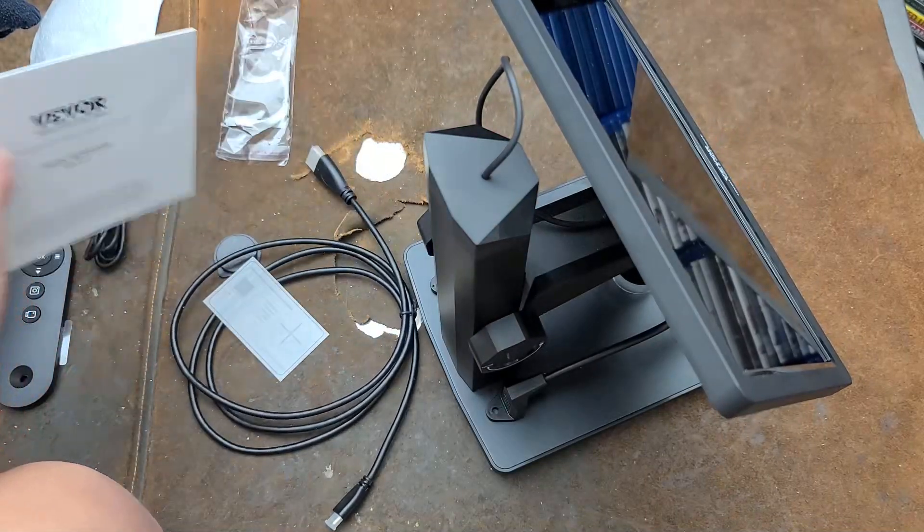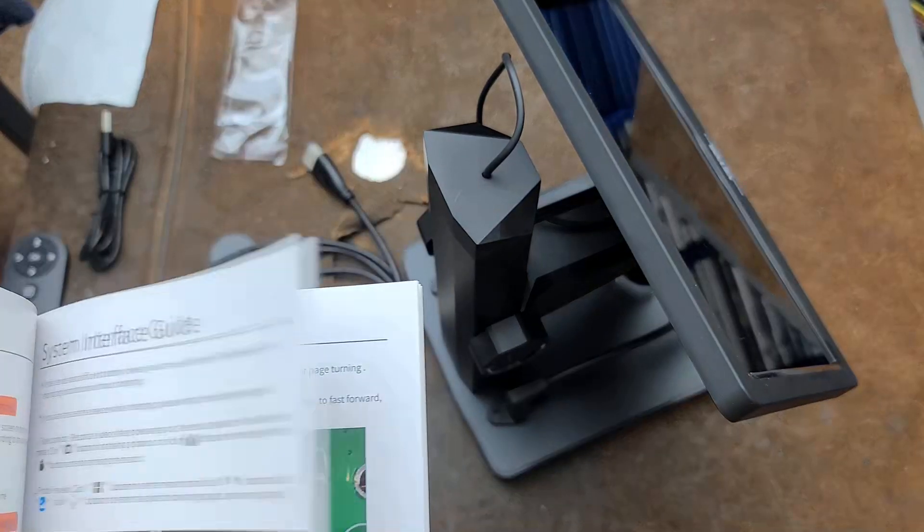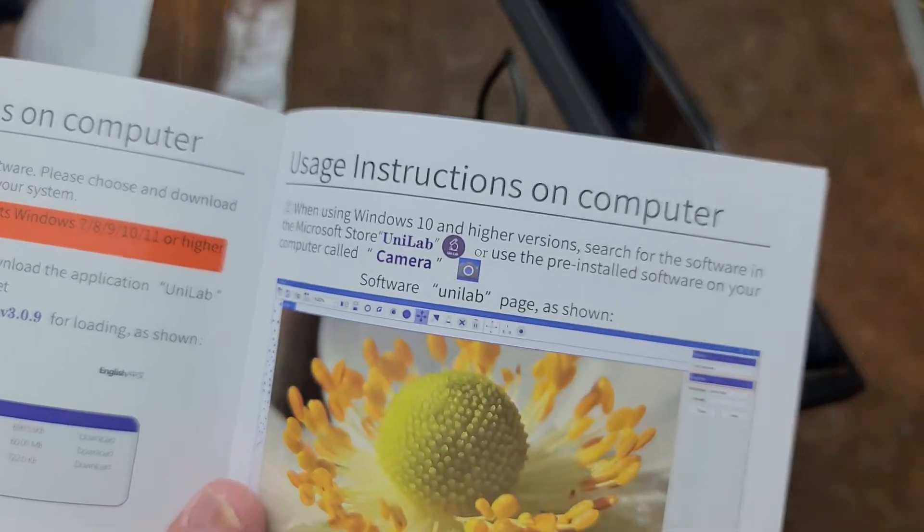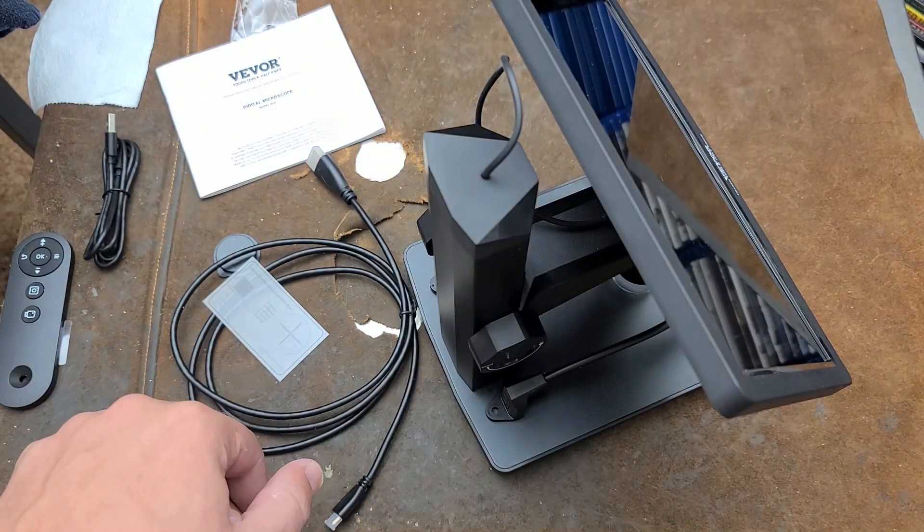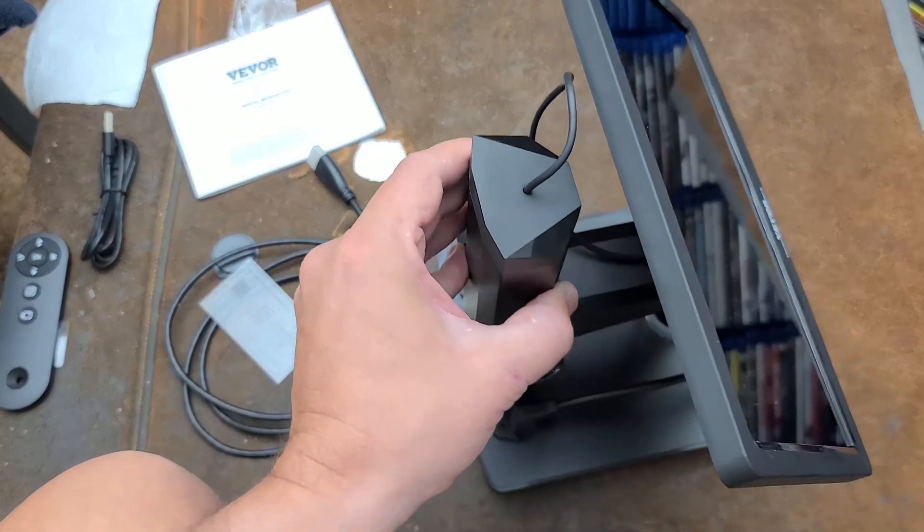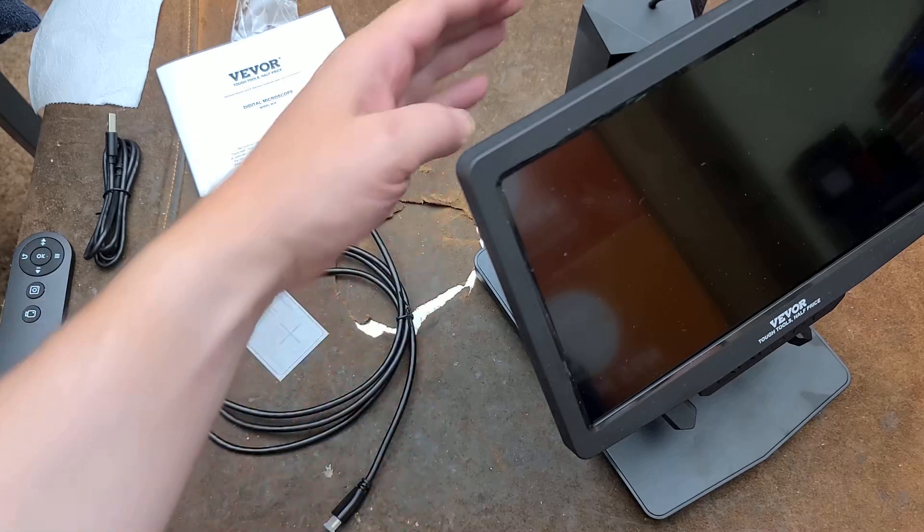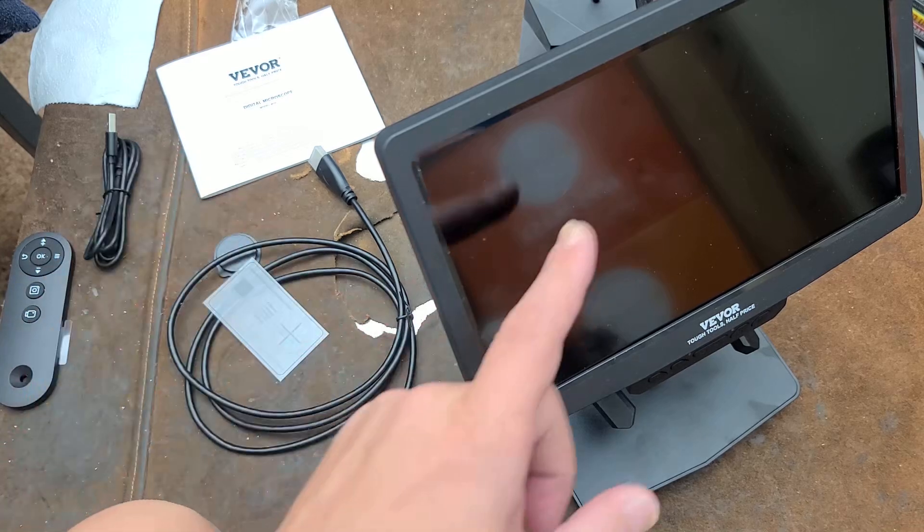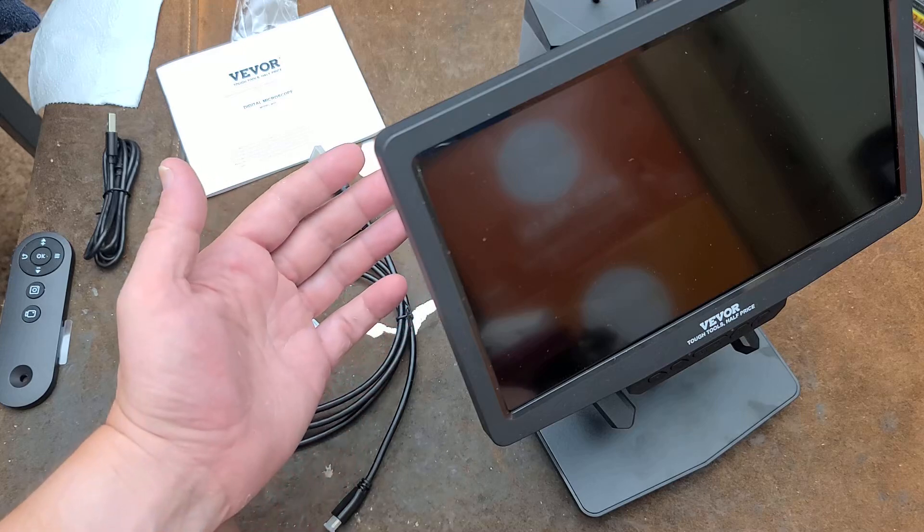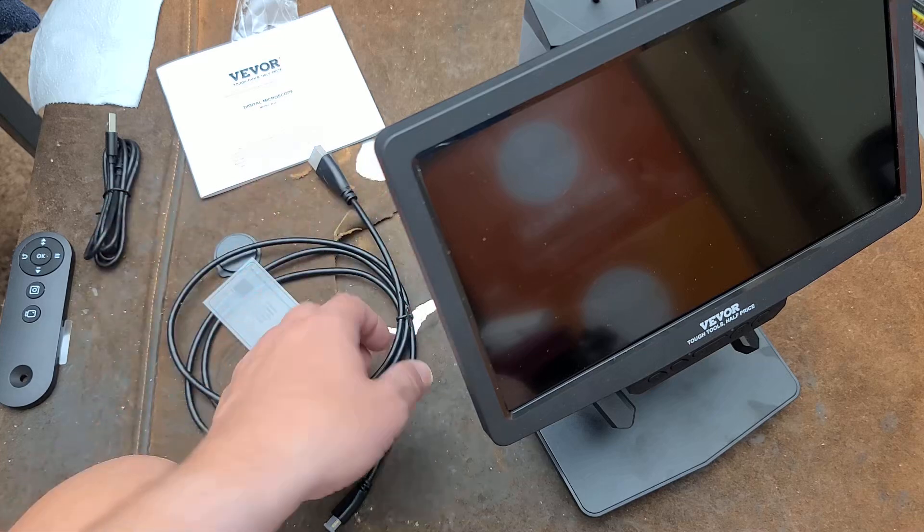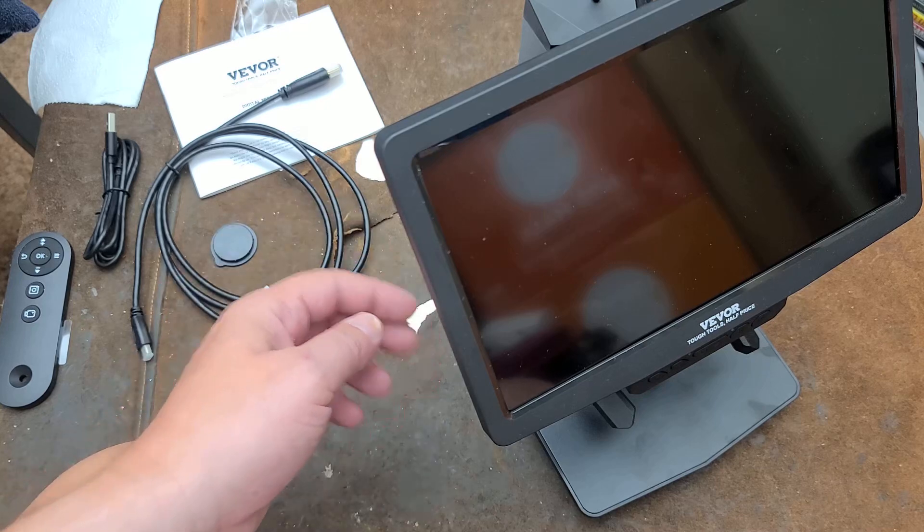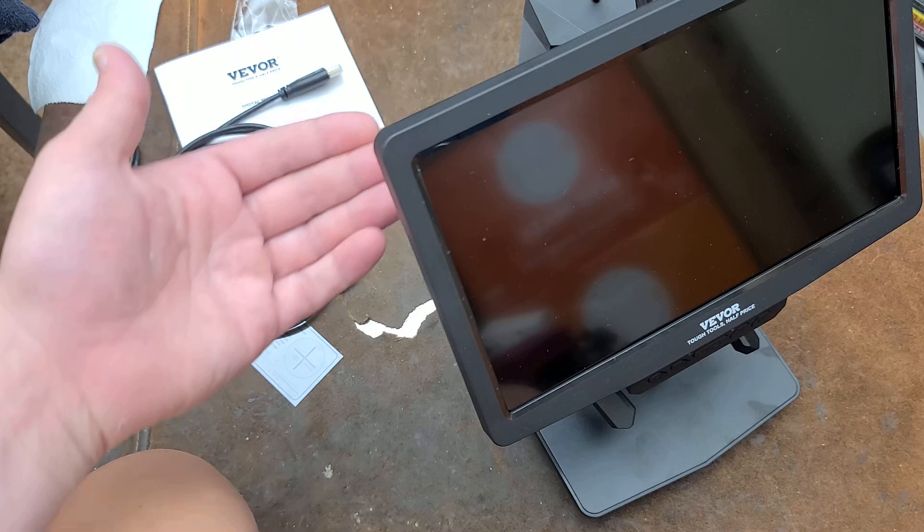Furthermore, apparently it supports some kind of Unilab camera. I haven't tried that for a second because I don't know if it will also work as just a USB webcam. To finish it out, it does, you can plug it right in the computer and just transfer data off. It'll ask you on the screen whether you want it in camera mode or just mass storage. It limits to two megapixel photos, maybe a different camera app, but the Windows built-in camera just sees it as like a webcam. So it offers you much higher photo resolution and video internally to the device, which kind of makes sense.